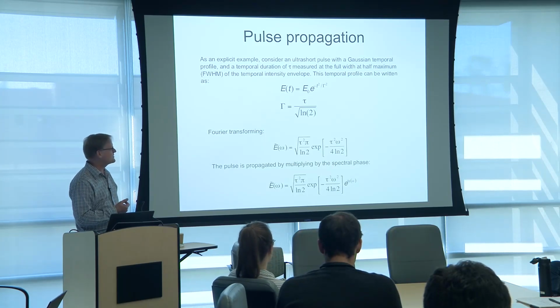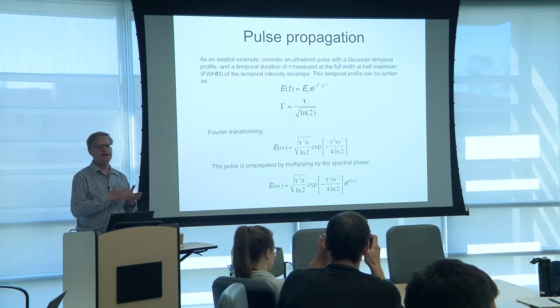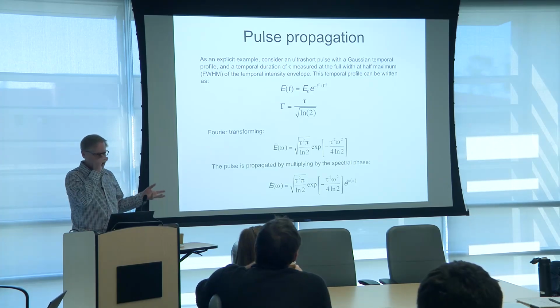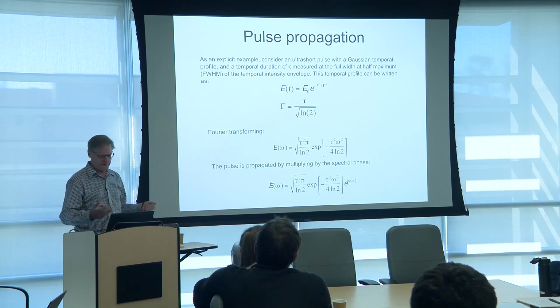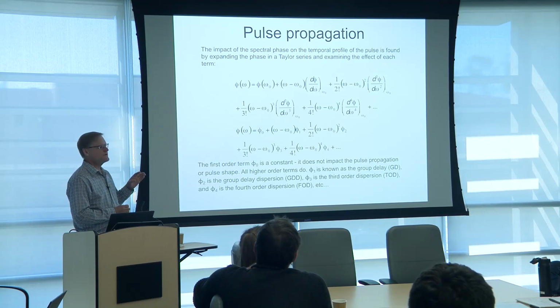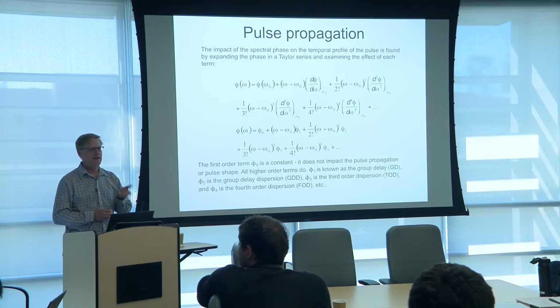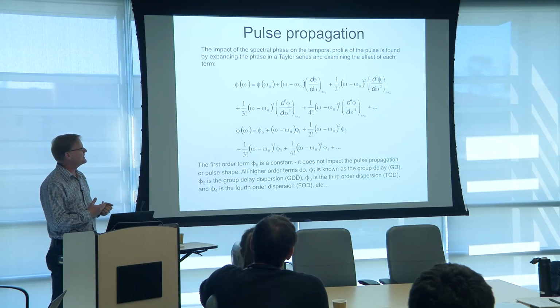Like Spencer's done a fantastic job showing, you can use tools like Zemax to calculate all the optical path lengths as you're going through the system and figure out, in a rigorous, quantitative way, all the different delays involved, the dispersion of the system as a function of wavelength. Then you can develop strategies for compensating for the dispersion of the glass of the microscope and the lasers, and it can be very spatially varying.